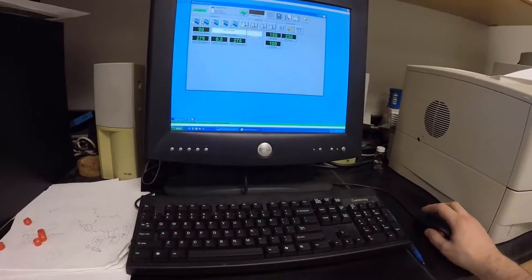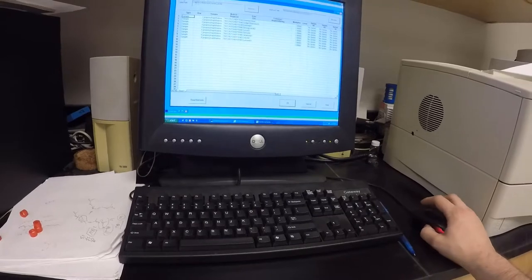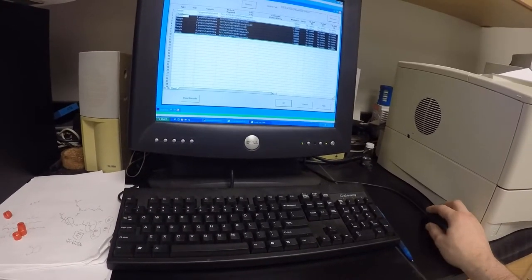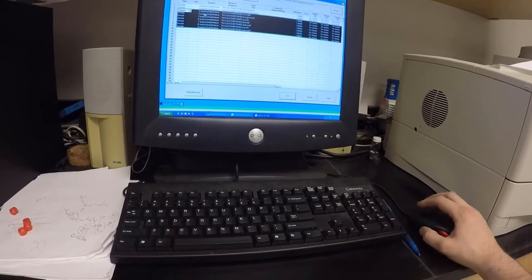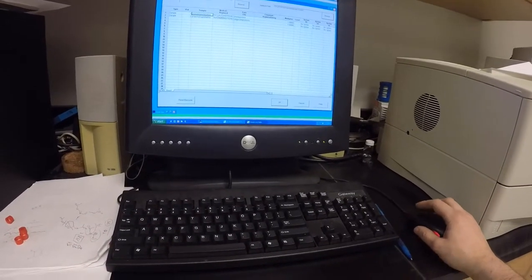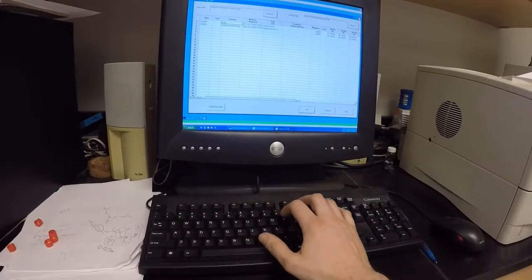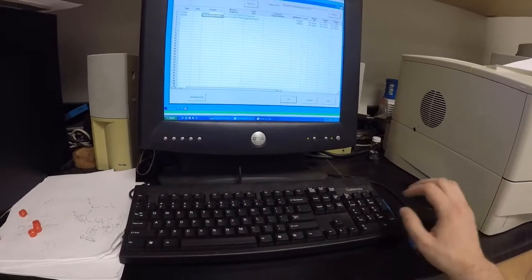Now it's time for us to set up our sequence table. Up here in sequence, we want to edit the sequence. You can see there's a whole bunch of stuff here that we don't need. I know I'm going to have two samples. They're already in vials 1 and 2. I'm just going to highlight what I don't need and delete the rows. Okay, so now we're just going to name the samples. I'm going to say this is olive oil 1, and olive oil 2.